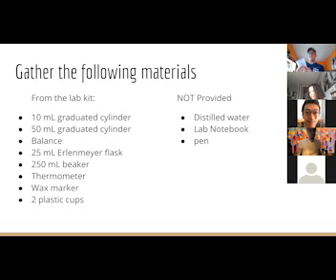Now, a beaker has all these gradations on it. And you can see the gradations on it. It is used to measure things, but what you really use this for is basically for transporting liquids around. It's not really for accurate measurements.